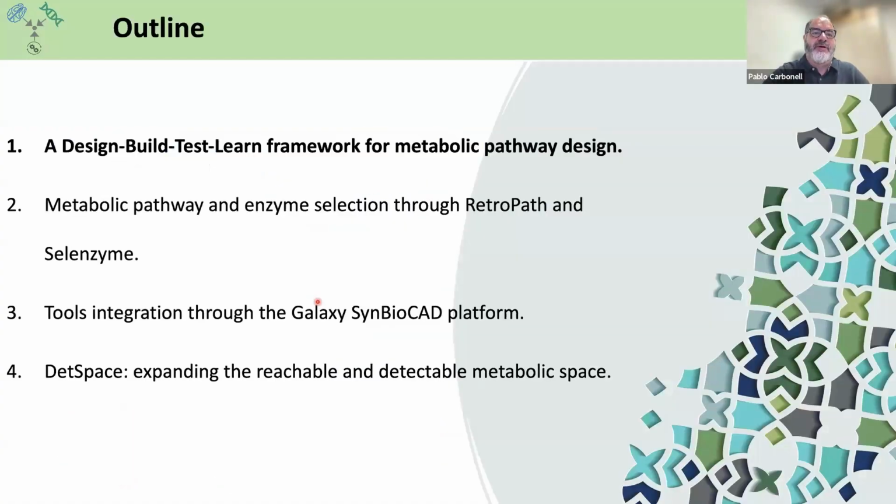That's why the way I'm going to present the tools is, first, I'm going to give you some introductory ideas of the context where we are using these tools, which is the design, build, test, and learn framework for metabolic pathway design. And then we will go directly into two of these tools, RetroPath and Selenzyme, for metabolic pathway and enzyme selection.